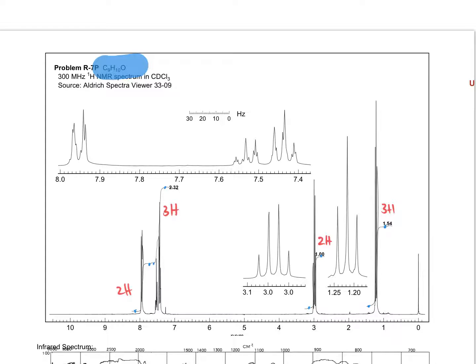Yeah, so if you have a carbonyl that has hydrogens attached to it, they will show up much farther. Between 7 and 9, sometimes 6.5 to 9, is a region very characteristic for aromatic protons, those phenyl rings and such. So these guys show up very far.